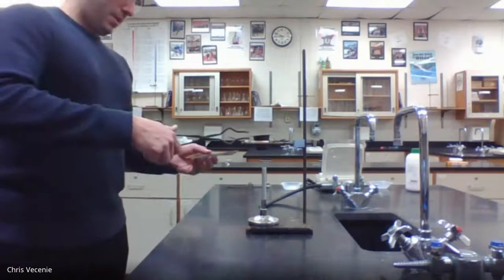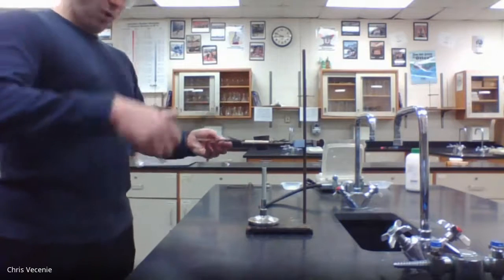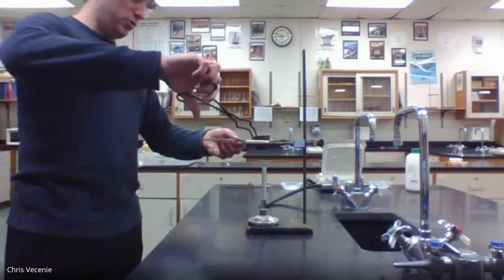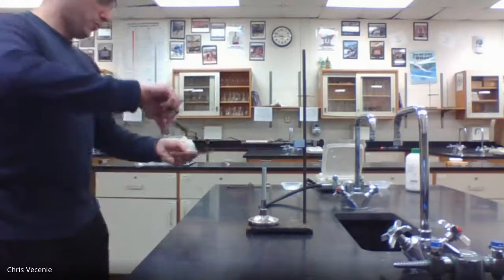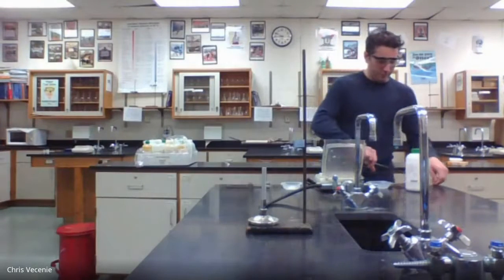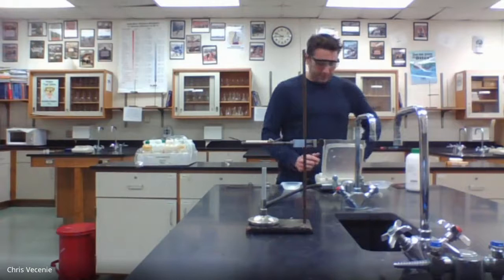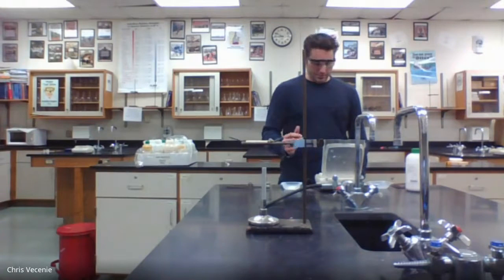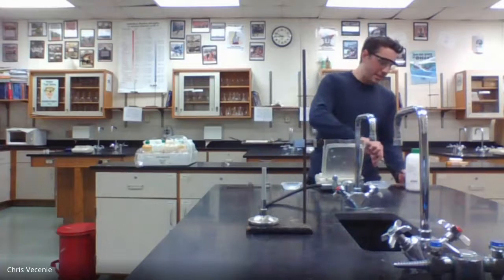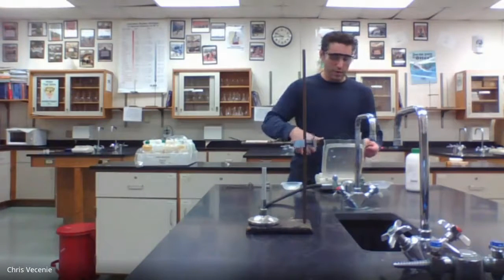All right, so I'm going to take my lid, move it off. Always bring your wire gauze up close. Grab your crucible and your tongs. Ease over to here. We'll let that sit for just a second. I'm turning on the balance. And it goes through its checklist. And the first thing I'm doing is just getting the mass of the empty crucible with the lid.